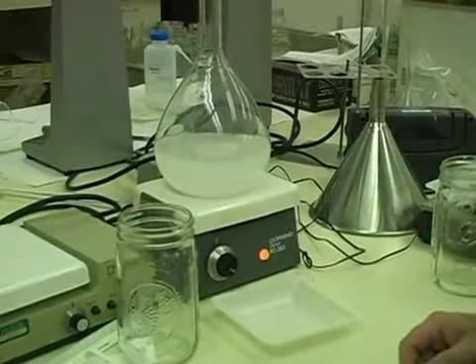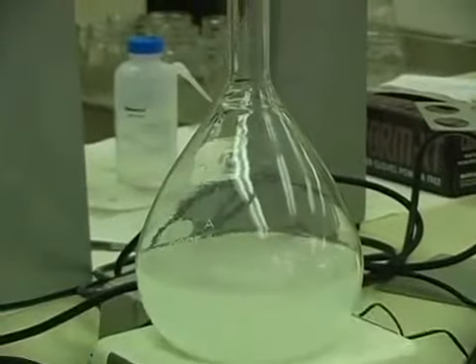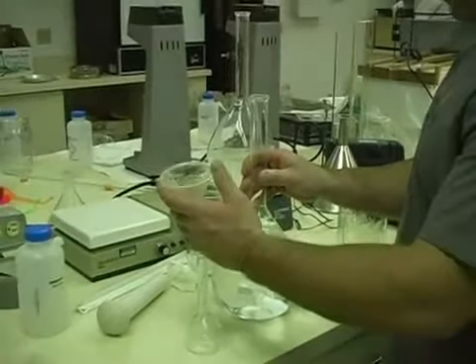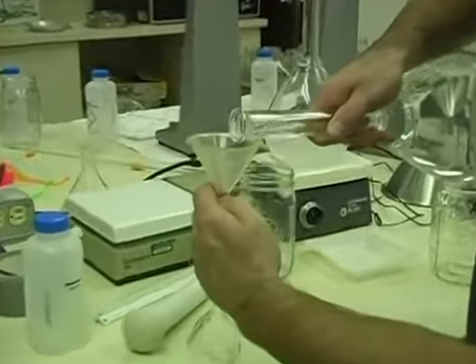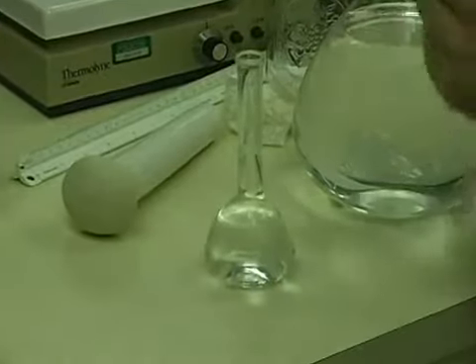You leave that there to mix for several hours to make sure that it's thoroughly mixed, and after that you're going to top it off exactly with distilled water, and you're going to end up with a solution that looks like this. So we've got our solution here, and we're going to take 100 milliliters of that solution. It's important to get this exactly 100 milliliters.